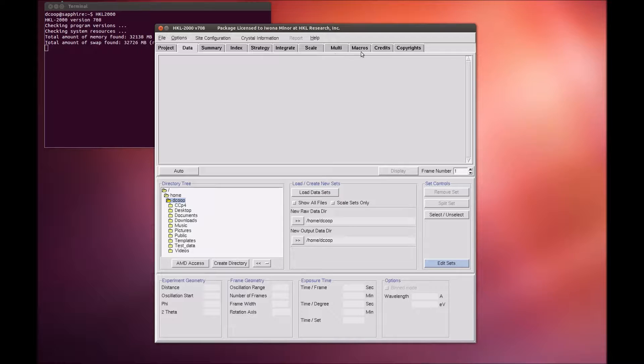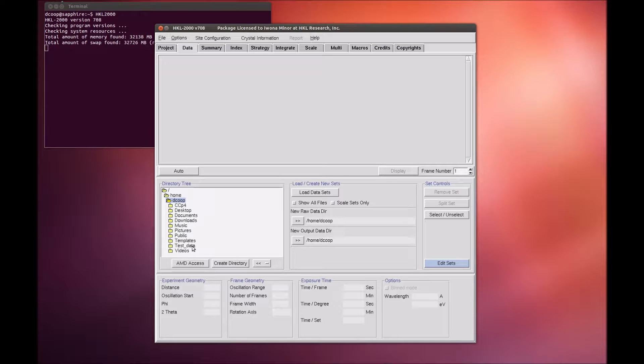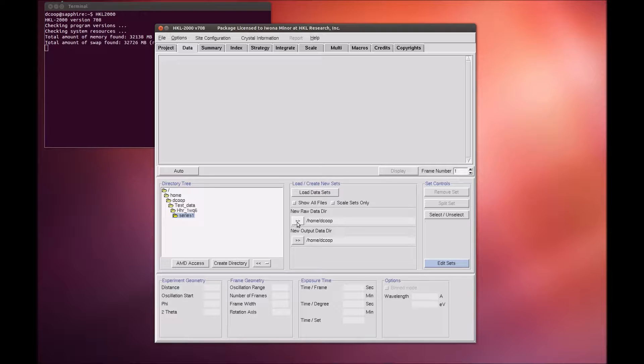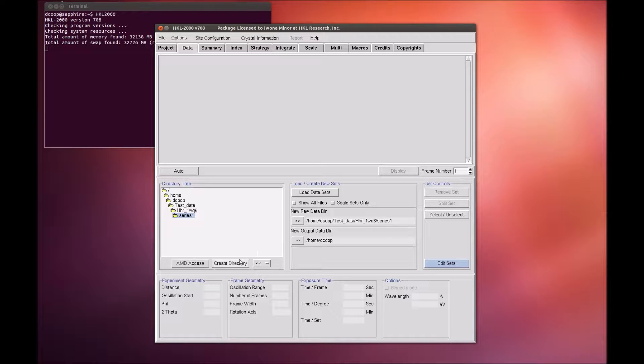The HKL interface has multiple tabs across the top of the screen, and it is in the Data Tab when the program launches. The first step of processing the data is to select where the data is. Use the directory tree on the left to navigate to and select the directory where the diffraction images are, and click on the double arrow button in the New Raw Data Directory field.